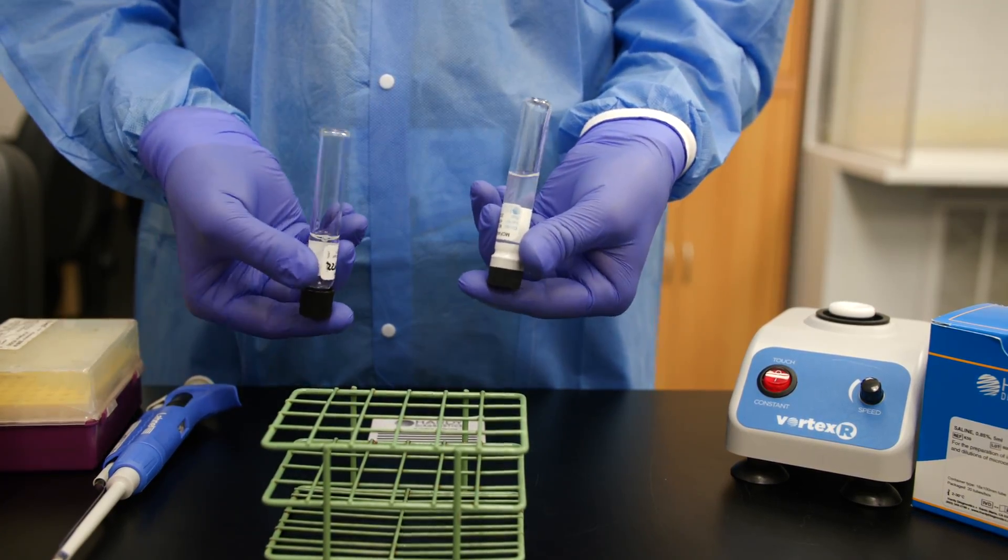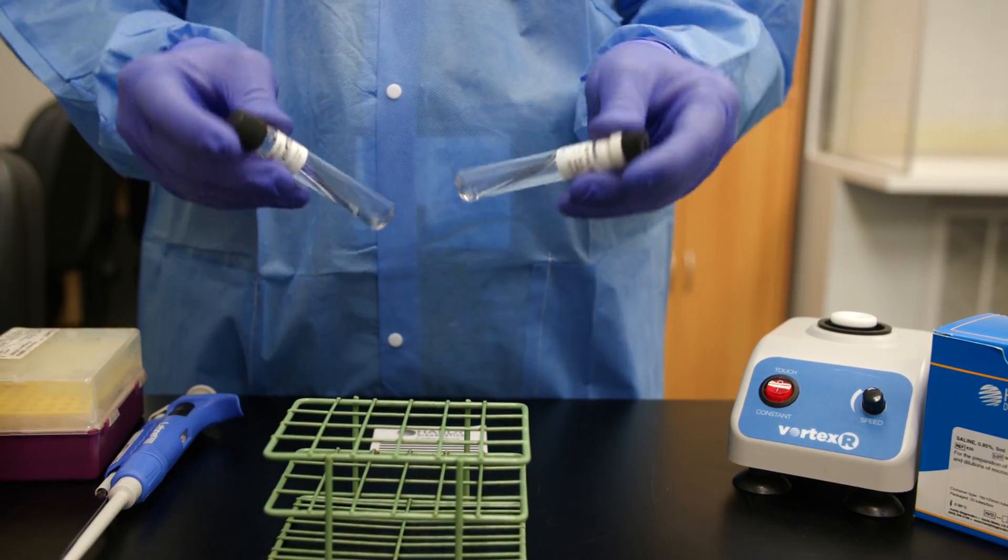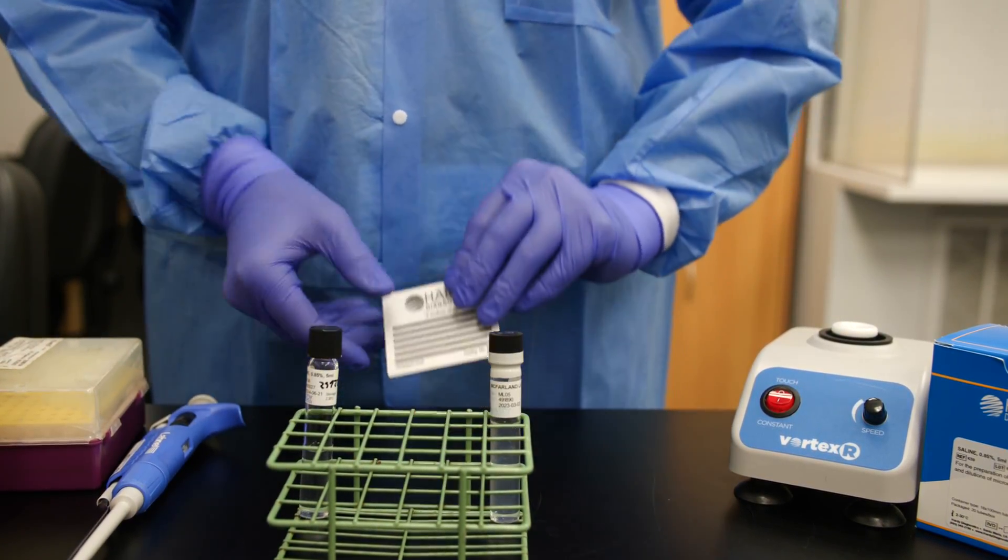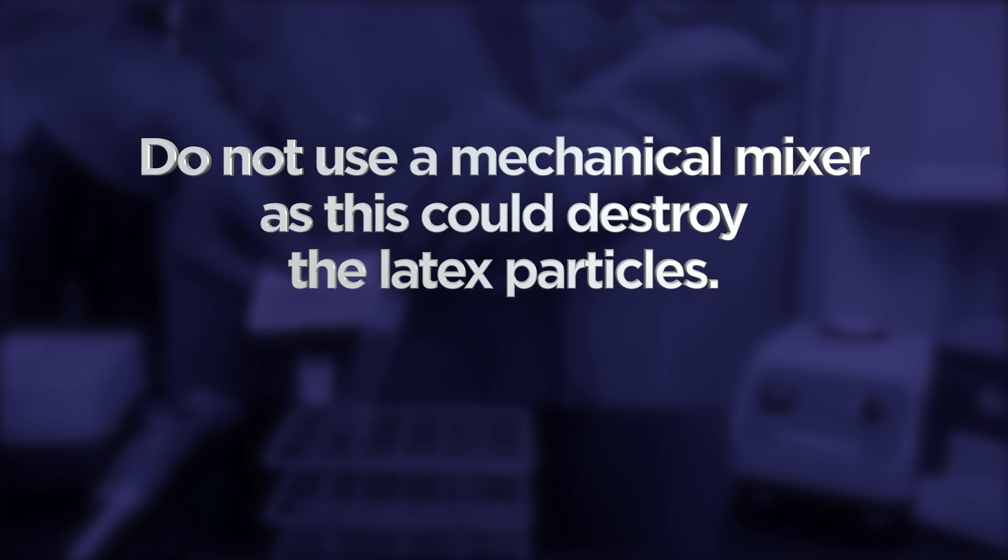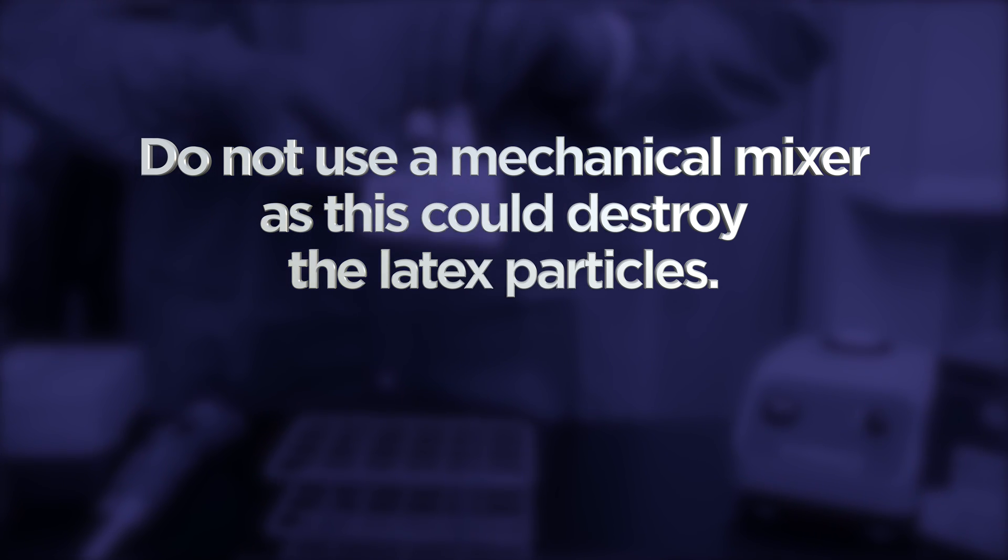Gently invert the 0.5 McFarland standard and the prepared bacterial suspension. Do not use a mechanical mixer or vortexer with latex standards. This could destroy the latex particles.